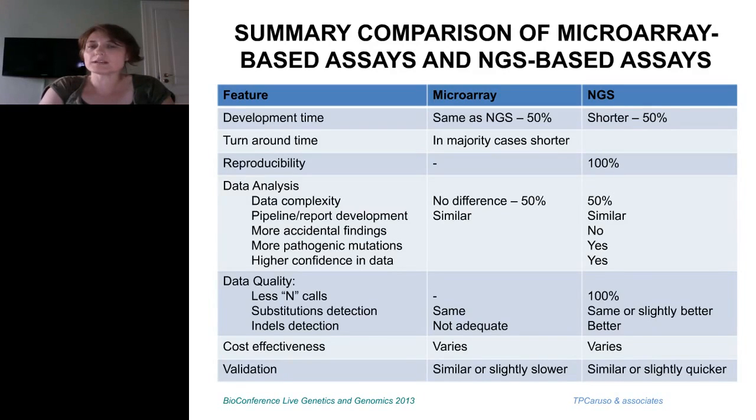And that could be related firstly to the data quality, but also to the fact that we are much more used to seeing sequencing results. And sequencing by hybridization is a little difficult for people initially to grasp and then to become really familiar with. When it comes to data quality, definitely this detection of indels, insertions and deletions, is the big plus.